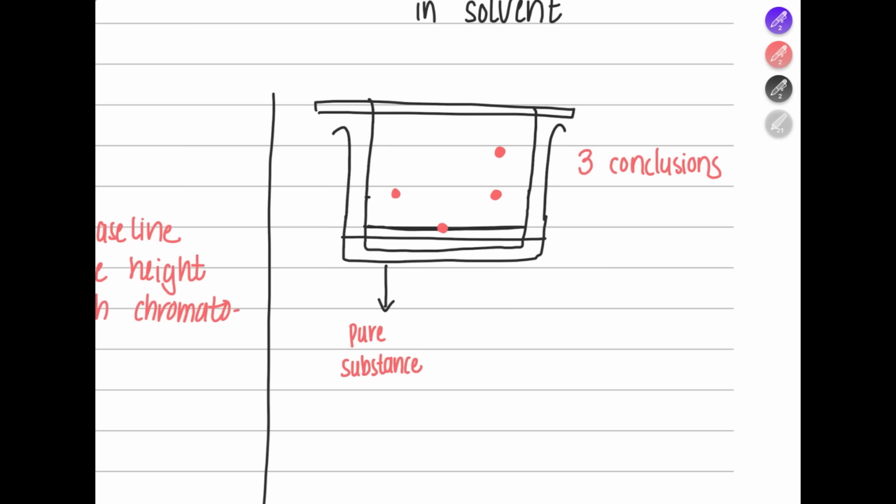Now the second one, you can see that this did not even move from the baseline. This means it was not soluble in the solvent. Now we cannot identify anything about it.